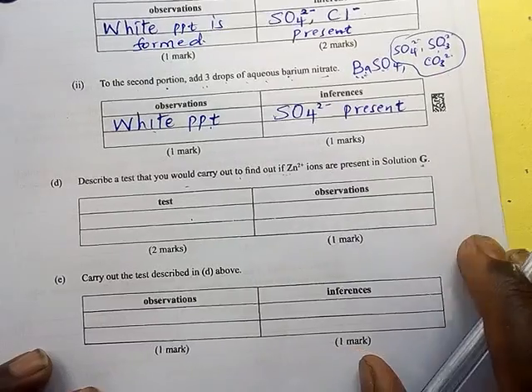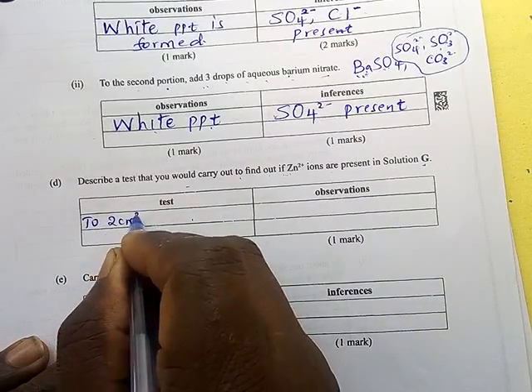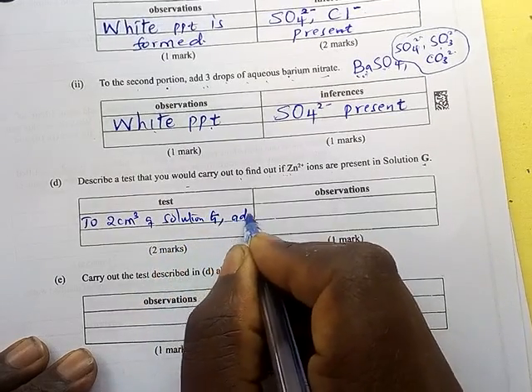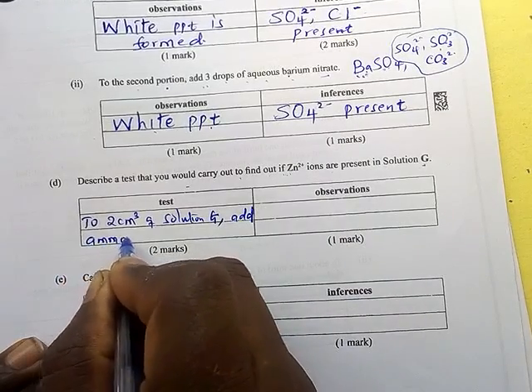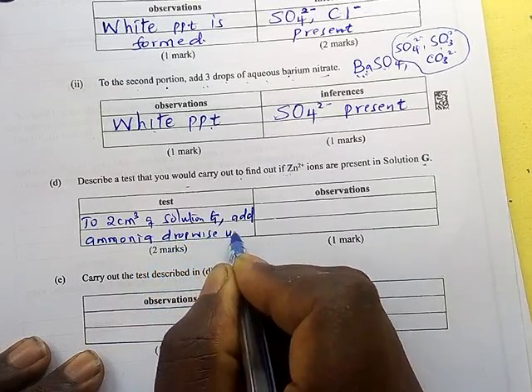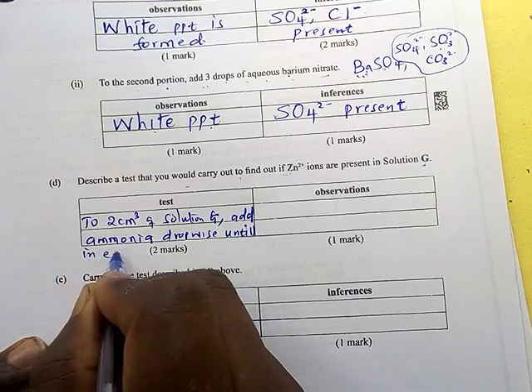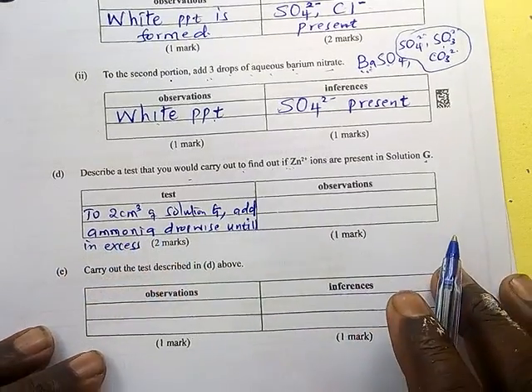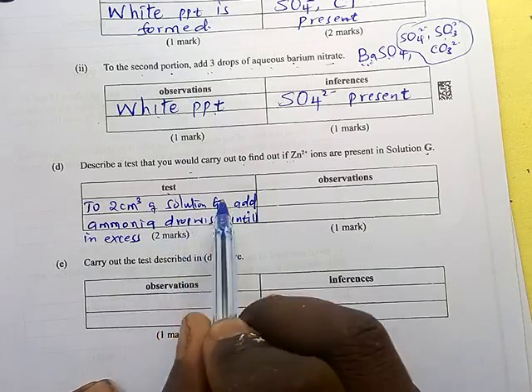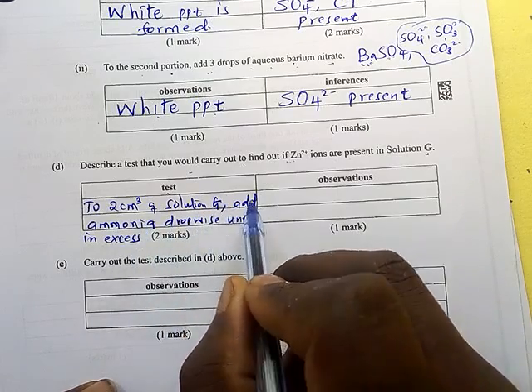You can copy. So you will say: to 2 centimeters cube of solution G, add ammonia solution, add ammonia dropwise until in excess. That is the test, the description of the test. So what do you expect? The expected observation is that a white precipitate is formed which will dissolve in excess.